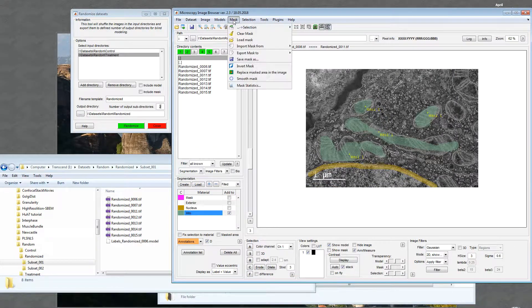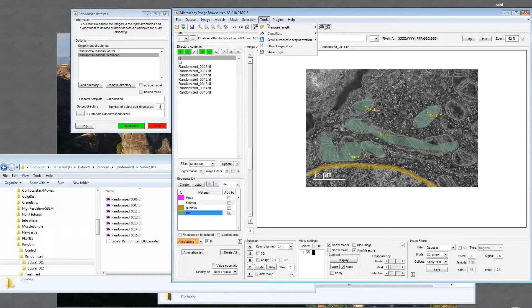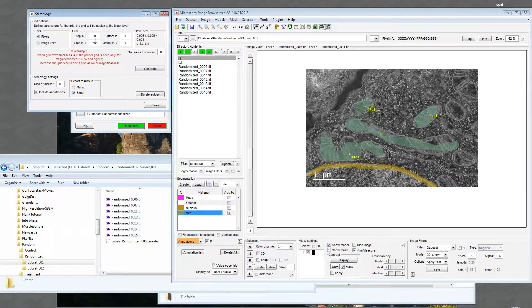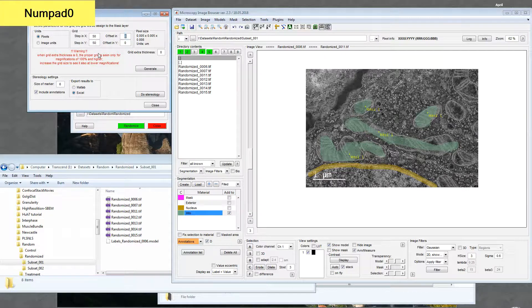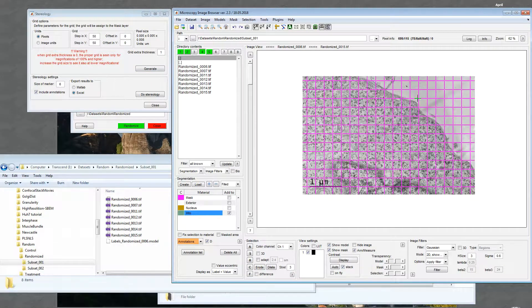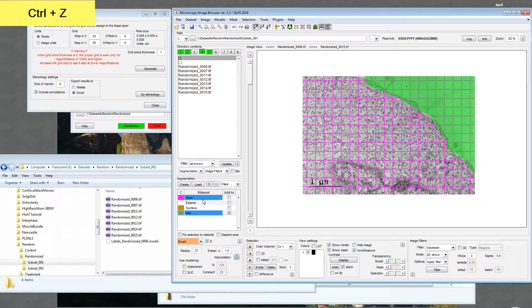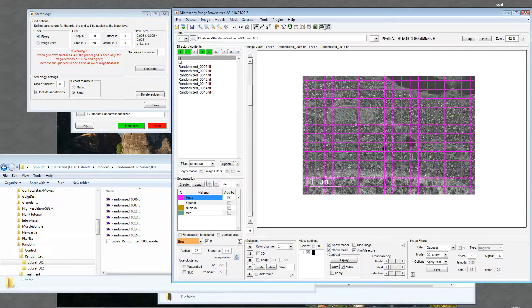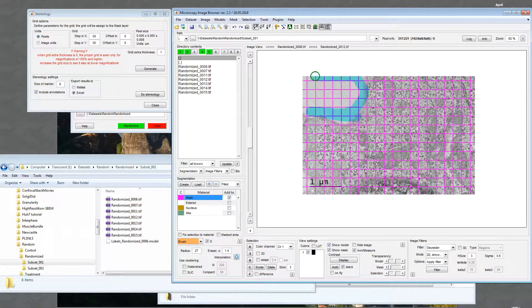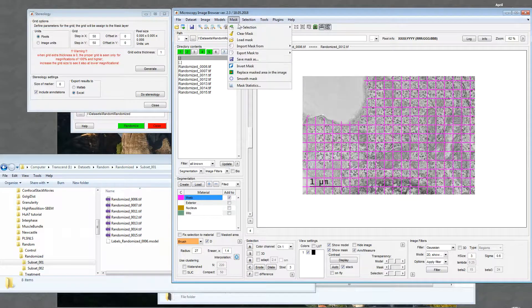Then I save the model. If I have masks I can save them as well. For example, if I'm interested in stereology I need to generate a grid of a certain size, maybe 50 pixels. I may also save the mask. If I'm not interested in segmentation outside of the cell, I can take the brush and quickly remove that area from the mask for a few slices, then save the mask.